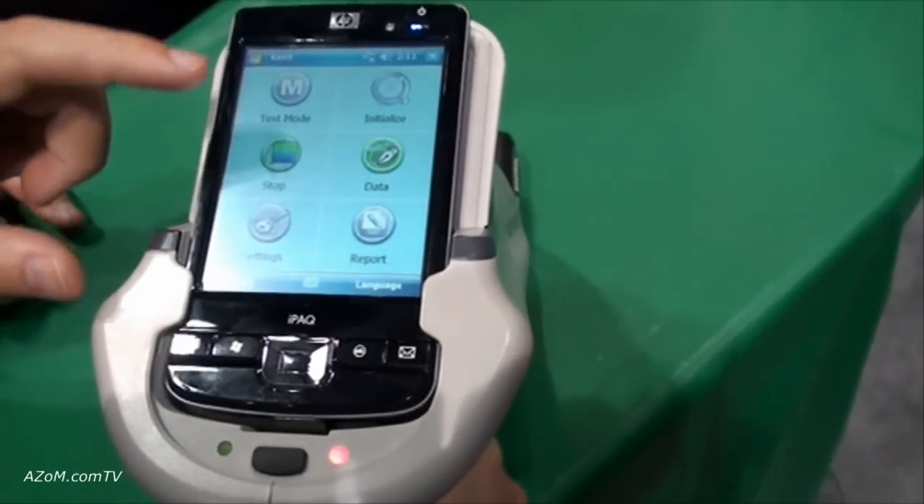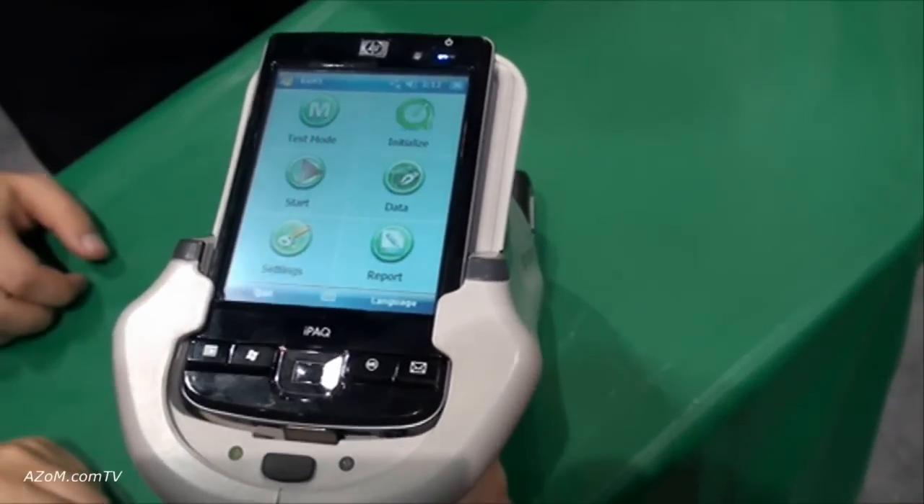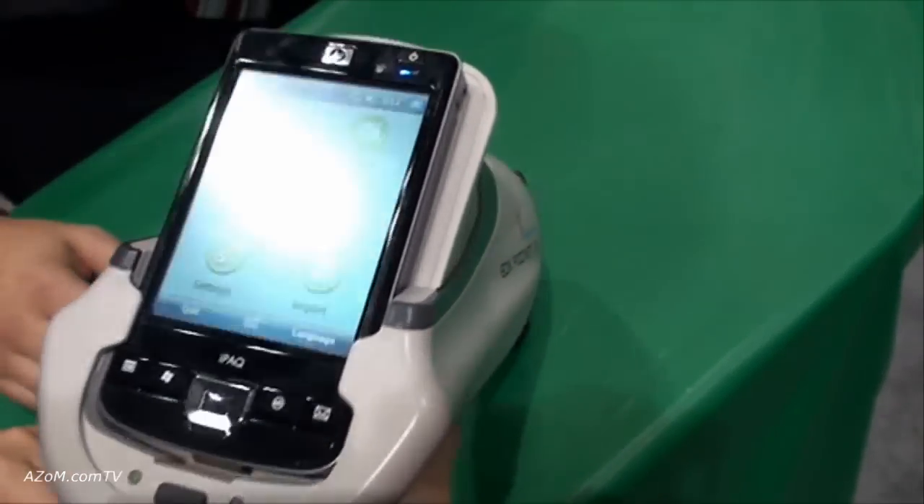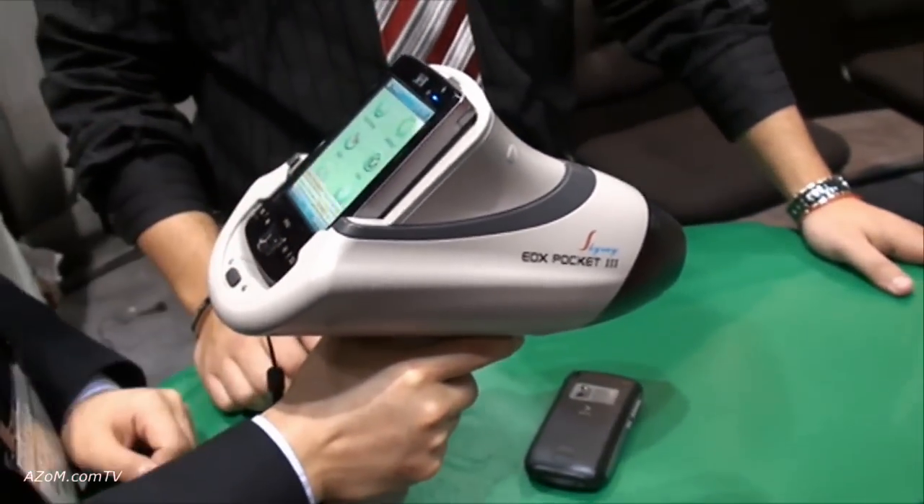After that you stop the test and you can get your results and connect it to the computer just like that.